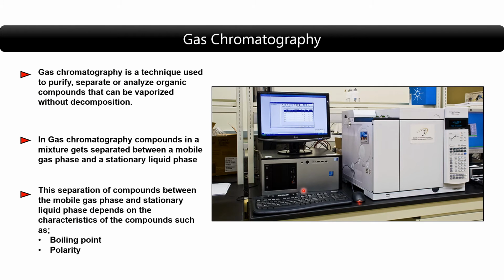Next, we're going to look at gas chromatography, because those two fractions that we collected, we are going to run them through a gas chromatogram and see how successful our distillations were. Were we able to 100% purify hexane? Were we able to 100% purify toluene? So our expectation is, since this is a partially successful distillation, we expect some little amount of toluene to be present in the first fraction that contains mostly hexane.